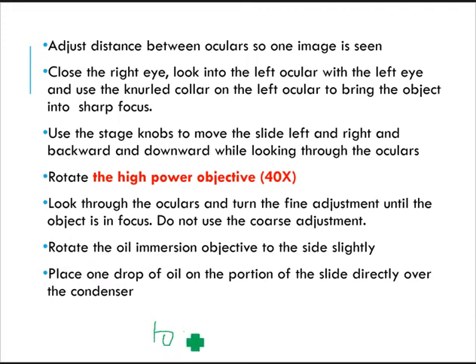For example, when the image is already sharpened and the working distance is smaller, the microscope locks itself so that the user, the med tech, or anyone cannot use the coarse adjustment anymore. So yeah, it locks automatically.